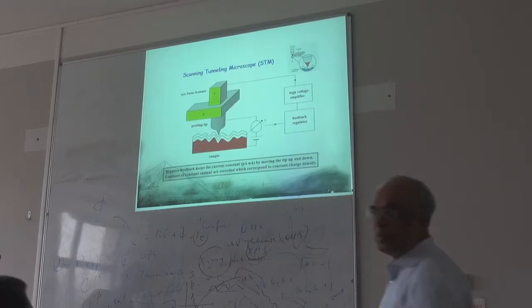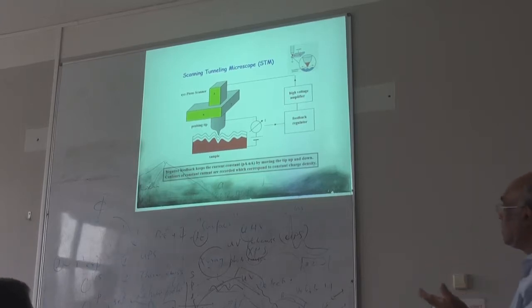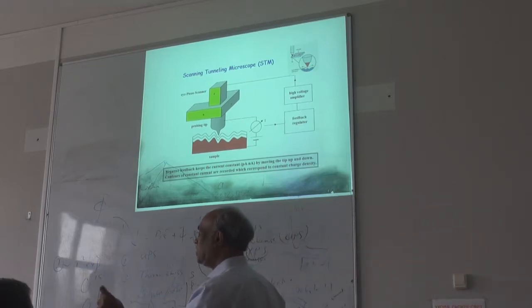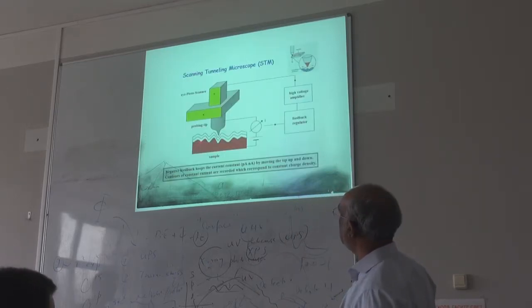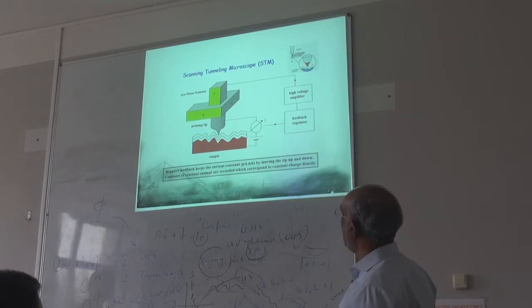Then I think probably everybody is familiar with the STM, scanning tunneling microscope. So this is a nice technique. You can look at atoms directly. This is a very simple technique. What you have is basically your sample, then you have a very sharp tip. Then you scan this over the sample.